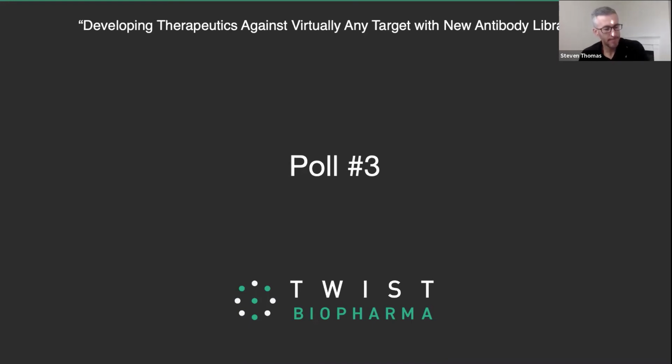Great. Thanks, Stephen, for the awesome presentation. We're now going to open up for questions. So if you have a question, please make sure to ask it in the Q&A box. We do have one question, Stephen. Is your panning performed on a solid support? Are there alternate formats available?